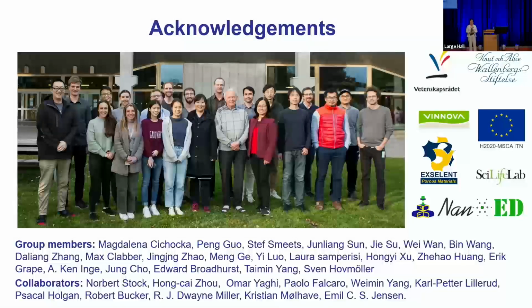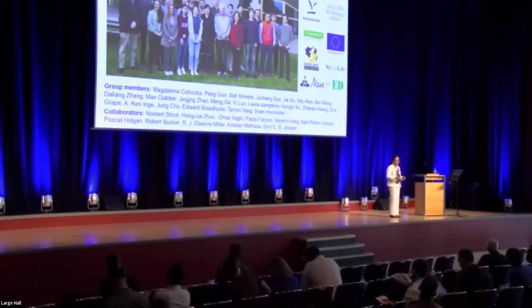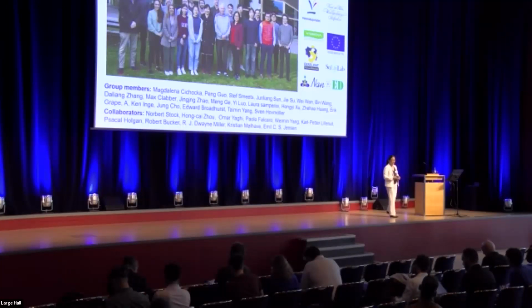Yes. Thanks for the opportunity. Thanks, Xiaodong Zou, very high technology. I have a question, very general. Can you image materials like amorphous materials and semi-crystalline materials? Thank you. Yes, you can do diffraction with amorphous materials. Then it's a different technique. It's called PDF, the pair distribution function. And also you can use 3D delta PDF. So there are, I don't have time to talk about it.